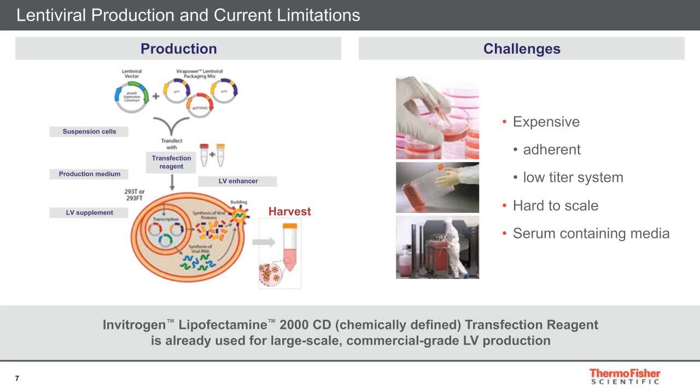And get those lentiviruses. Now, if you think about it, you are injecting millions and billions of T cells, and for each T cell, you need at least 2 to 10 lentiviruses to be able to transduce those T cells. So you need a lot of lentiviruses.